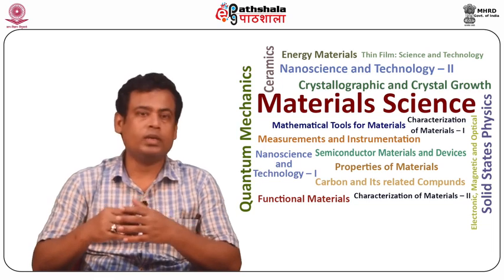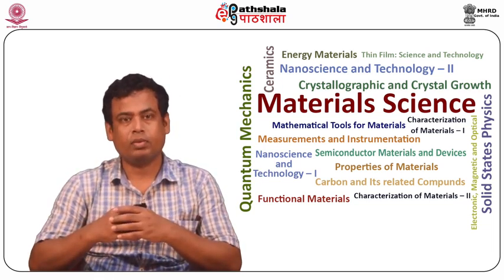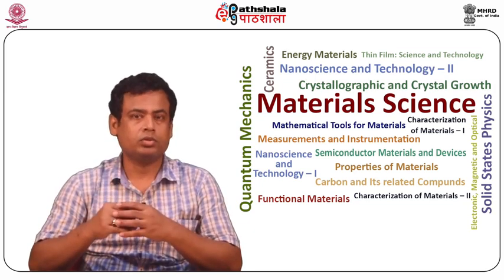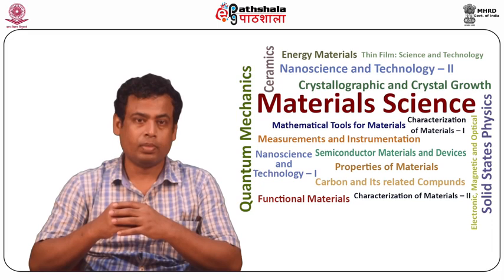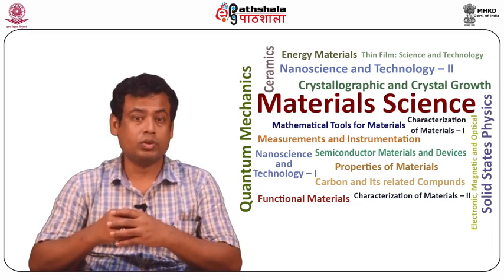Now let us see what the different issues with insulating materials are. In insulating materials, it is difficult to remove the incident electrons on the surface of the material by pursuing electrical conduction methods through the material.